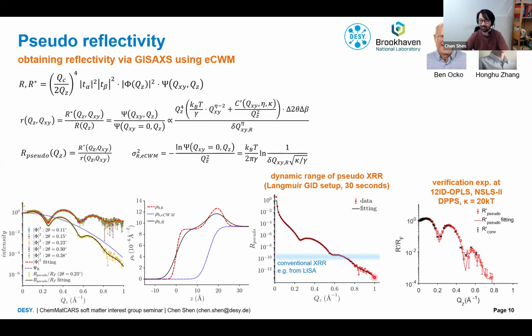Now we have the Eiger 4M, so we hope that we can see something further. Because once we accidentally put the detector closer, we still saw diffuse scattering up to 1.2 inverse angstrom, so it's not ending. And the conventional reflectivity usually reaches 10 to the minus 10 instead.